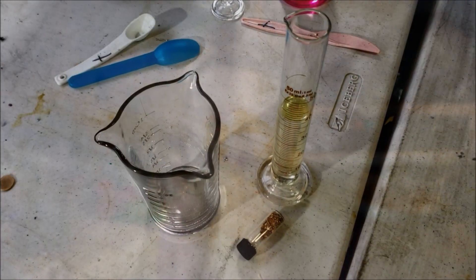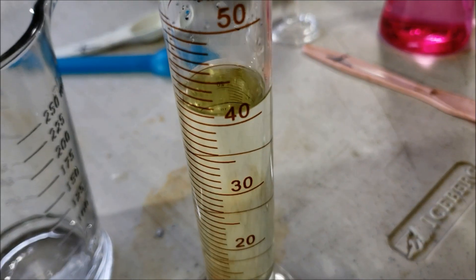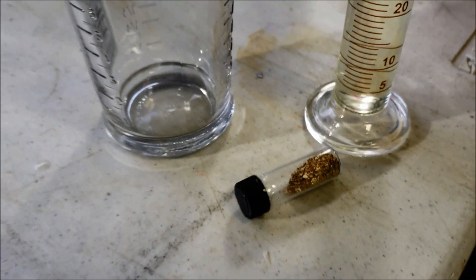Alright, here we go - dropping the SMB. A little over 10 grams of gold from the rivers, 40 milliliters of aqua regia. Let's see what happens.